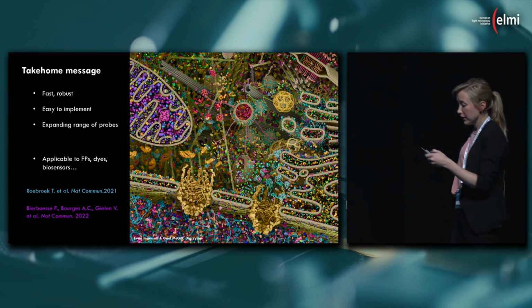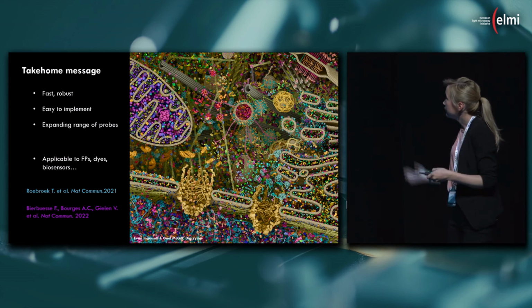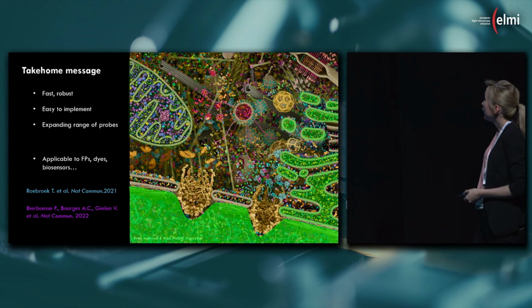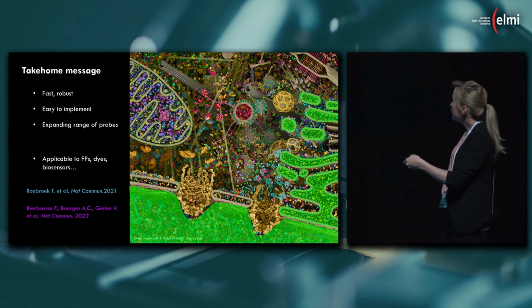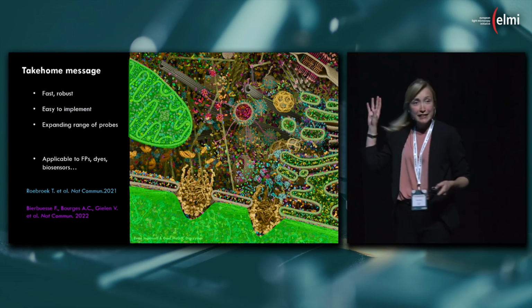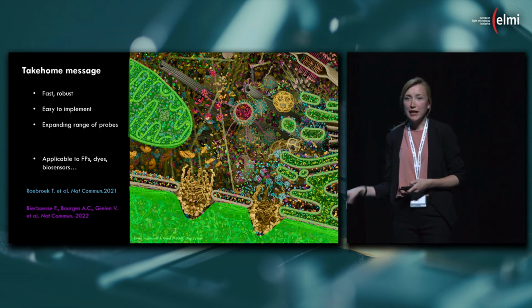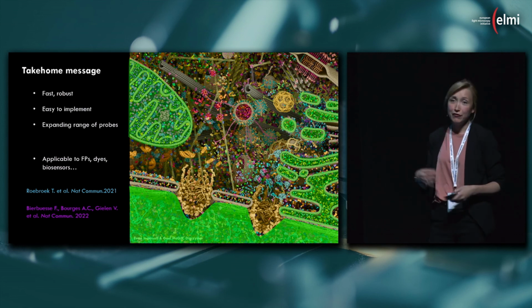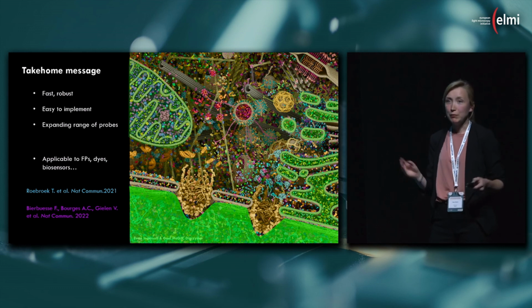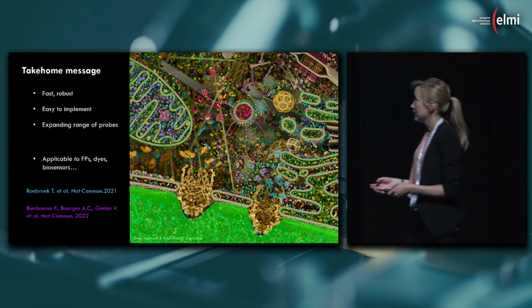And in the end, when I showed this cell, which is very complicated, when I use labeling for example of the nucleus, mitochondria, or endoplasmic reticulum, and if these probes are photochromic, I can use the same color, and I still have, I don't know, red and blue for other structures, and I can do multiplex imaging. I can follow multiple components in a cell.